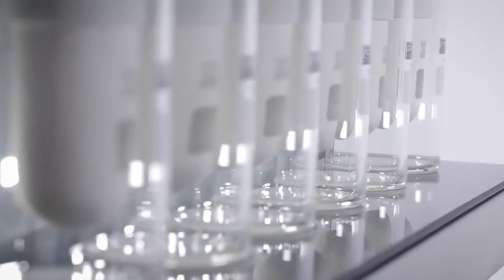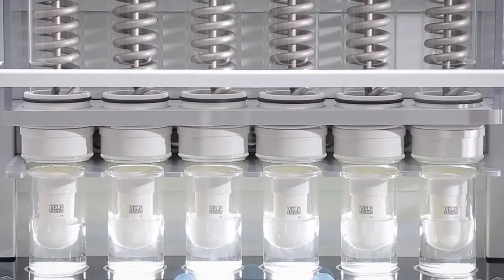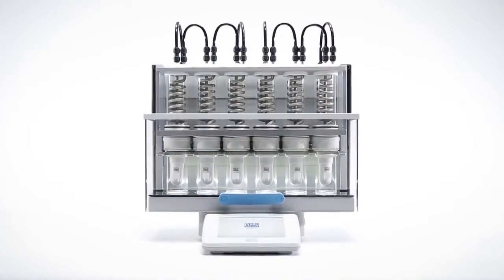The SER158 is yet another reliable analytical instrument designed and manufactured in Italy by VELP Scientifica.